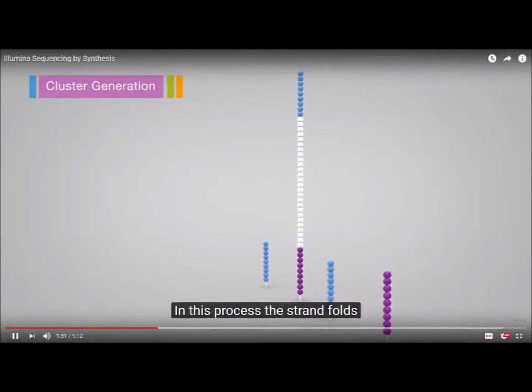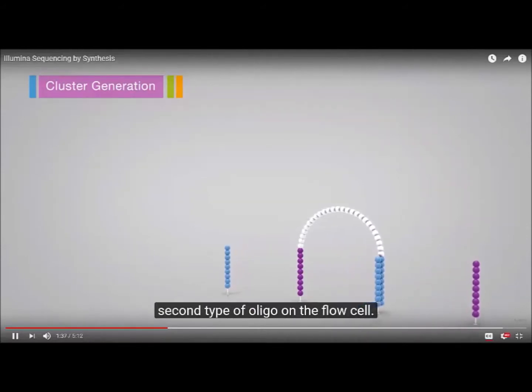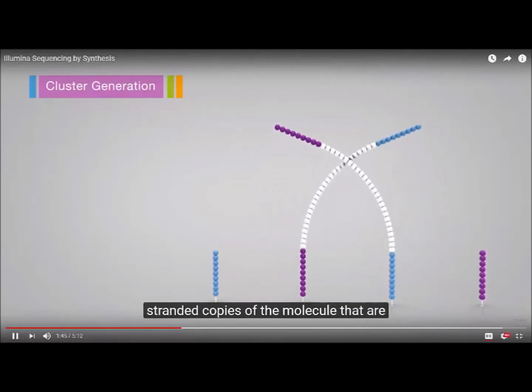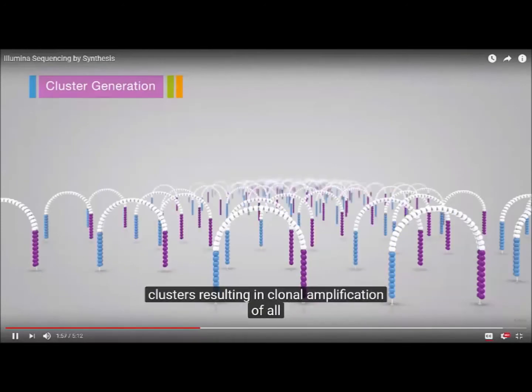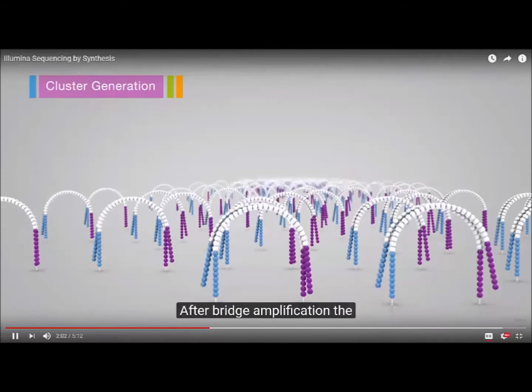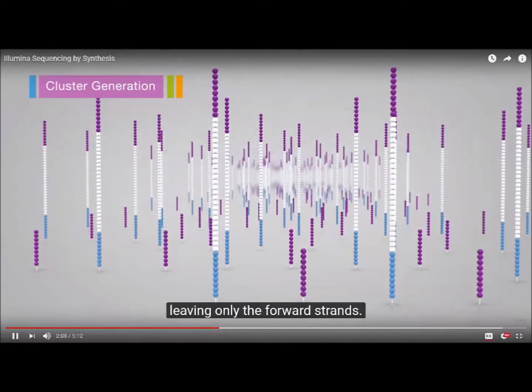In this process, the strand folds over and the adapter region hybridizes to the second type of oligo on the flow cell. Polymerases generate the complementary strand, forming a double-stranded bridge. This bridge is denatured, resulting in 2 single-stranded copies of the molecule that are tethered to the flow cell. The process is then repeated over and over and occurs simultaneously for millions of clusters, resulting in clonal amplification of all the fragments. After bridge amplification, the reverse strands are cleaved and washed off, leaving only the forward strands. The 3' ends are blocked to prevent unwanted priming.